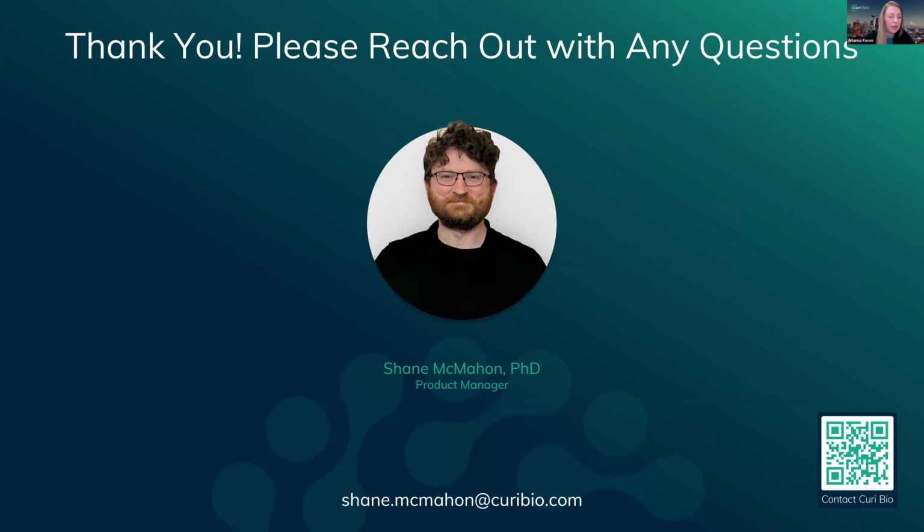Next question is from Austin Berry. Do you feel there is an advantage of using a ratiometric dye like Fura-2 AM over non-ratiometric dyes like Fluo-4 AM, or vice versa? In certain cases, there are. It depends on the experimental design and your hardware.